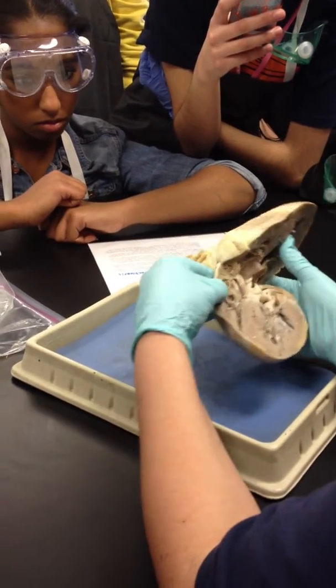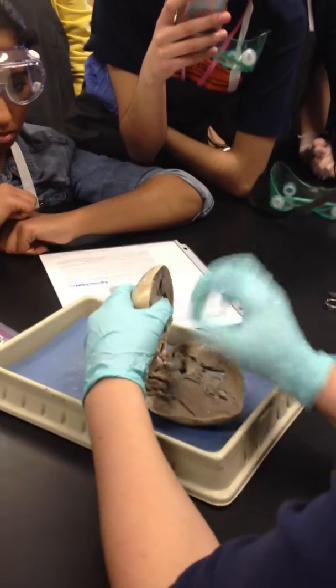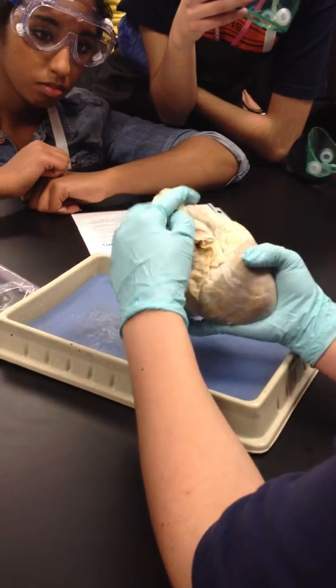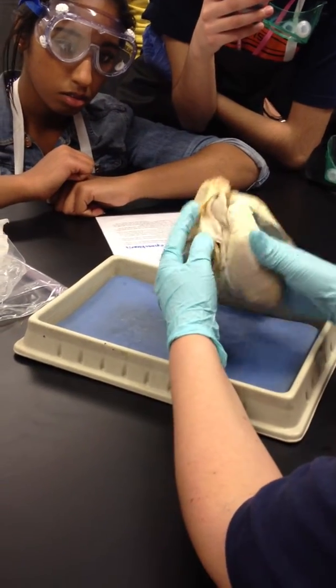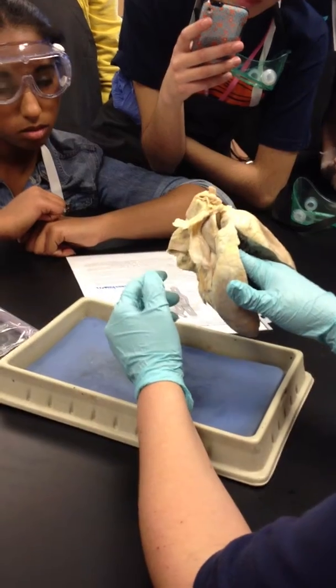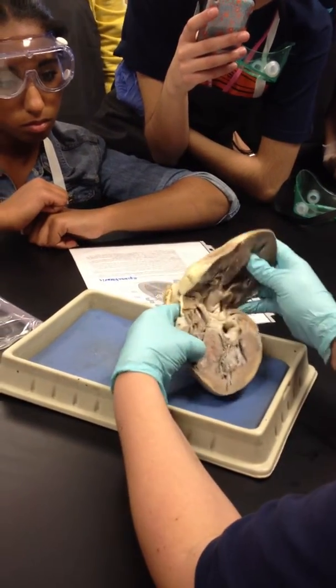So here we have our right atrium. If I stick my finger in here, and you can see my fingers right there, this is the superior vena cava. Most of you guys cut off your inferior vena cava, and that's fine, but this is the superior vena cava. The superior vena cava and inferior vena cava, as well as the coronary sinus, are going to dump all the deoxygenated blood into the right atrium.